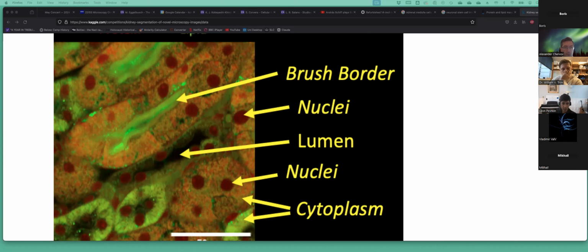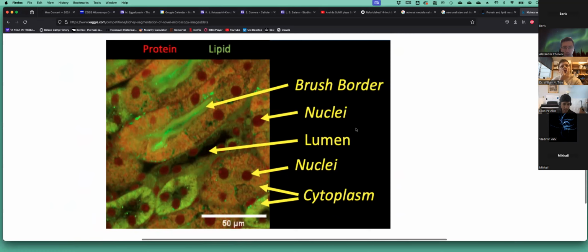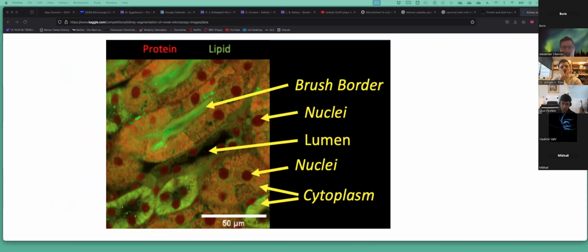Look back at the slide which Will is sharing now. You see the nuclei? Right, so let's start with that. You have a pile of images with this data. Can you reliably identify nuclei? I guess we can do that. It looks very doable, right? Then, by constellation of nuclei, you should be able to identify tubules. Okay, that's doable. On the other hand, if you know where the tubule is, it helps you find the nuclei.